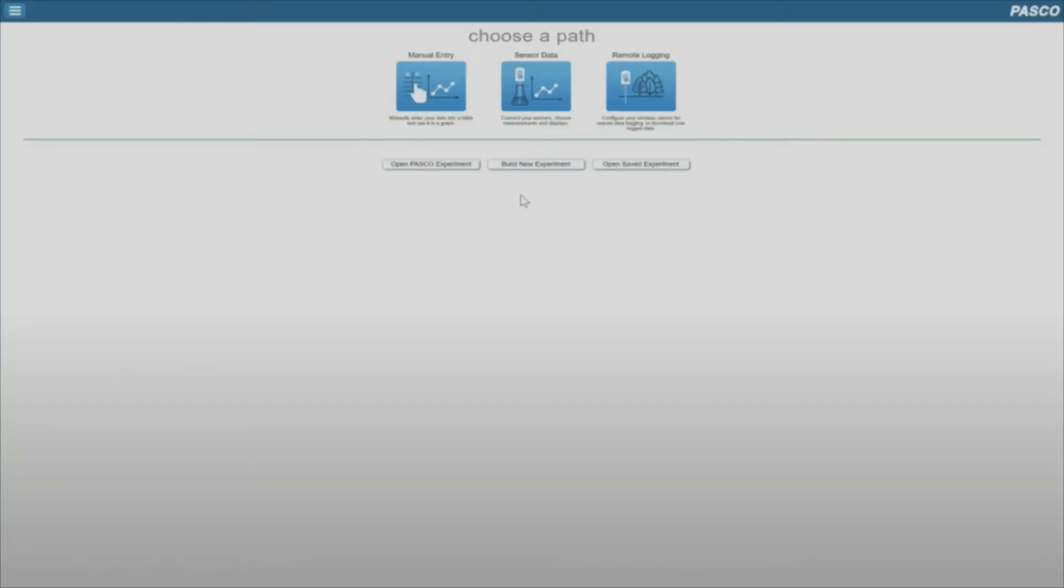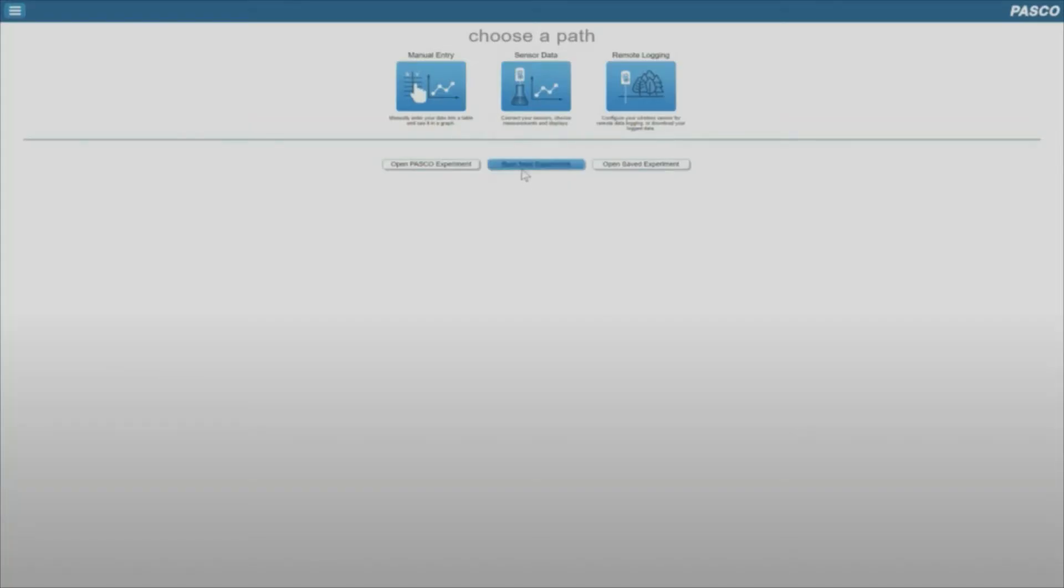SparkView is the second program we will use frequently in this class. With our equipment, we can use it to measure pressure, temperature, pH, conductivity, and more. When you open this program for an experiment, you'll first click the Build New Experiment button.